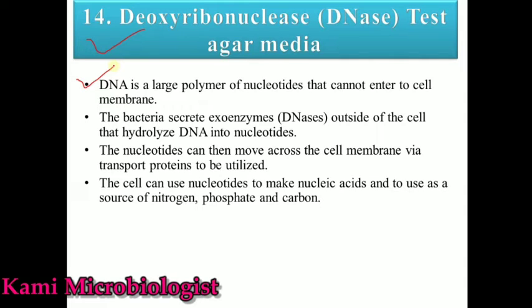As all of you better know, DNA is a large polymer and the cell cannot take it up. So for that purpose the cell has to degrade it into nucleotides, because DNA is made up of nucleotides. Once the cell breaks it down into nucleotides, the cell can easily take it up.